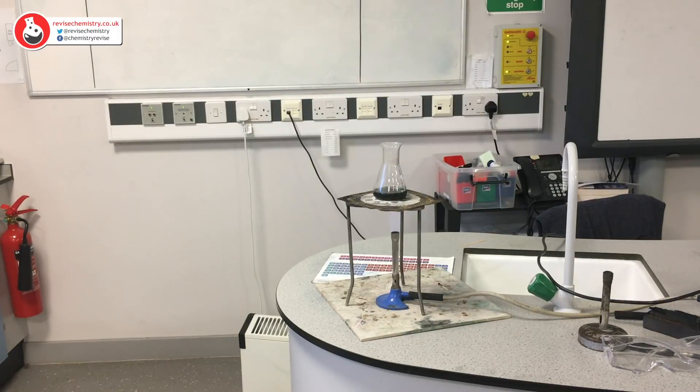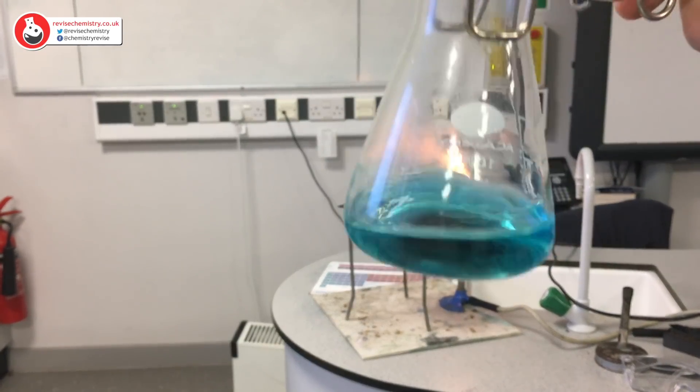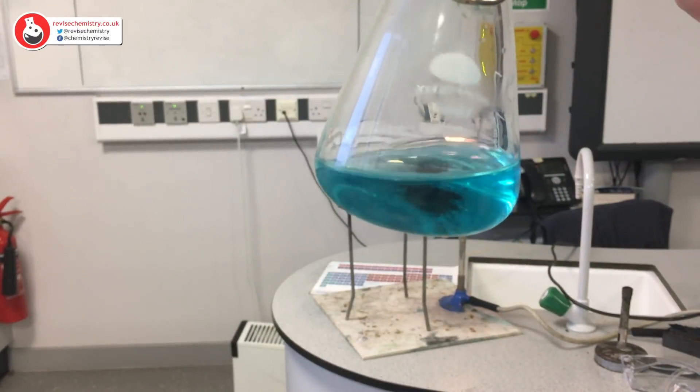This reaction should happen fairly quickly at this temperature and we should start to see a colour change. We can see that our reaction mixture has turned a lovely blue colour, but there is still some of the black copper oxide left.